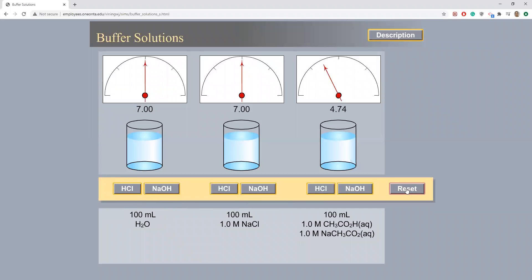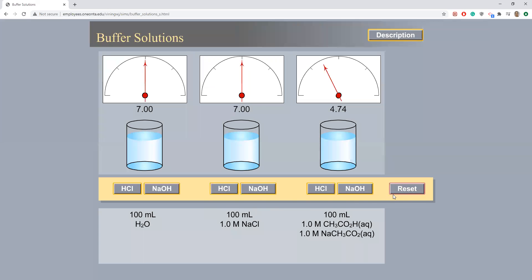Now we will work with 100 milliliters of 1 molar NaCl. An addition of 10 milliliters of 1 molar HCl solution results in a pH change from 7 to 1.04. An addition of 10 milliliters of 1 molar NaOH solution results in a pH change from 7 to 12.96.